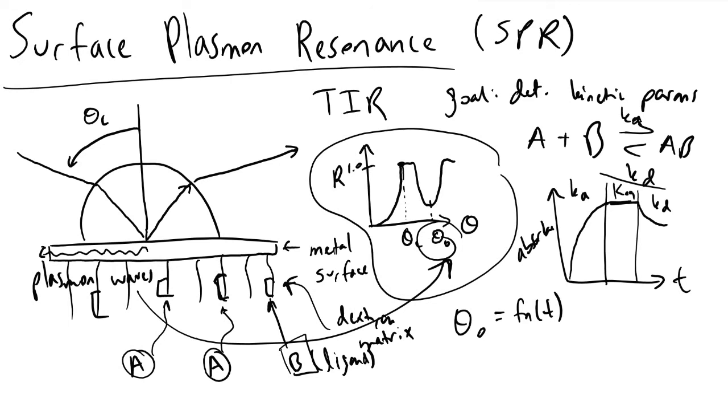With these values, we can now come to a much better understanding of how a protein is binding or interacting with an analyte, much better than just knowing the equilibrium value, because quite often in practice we're very interested in the kinetics and not just the equilibrium values. So it is very important to understand how these processes work and how we actually evaluate these things in practice.